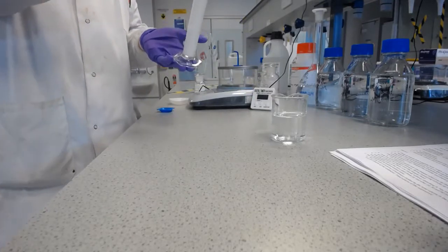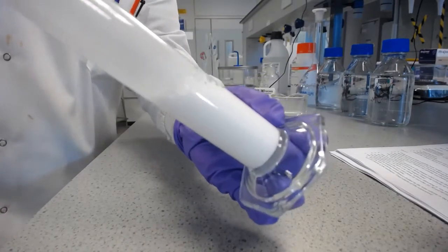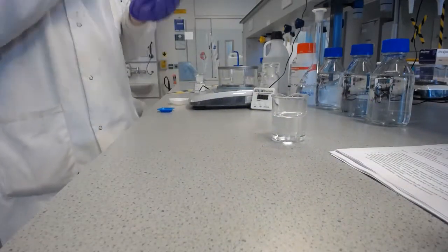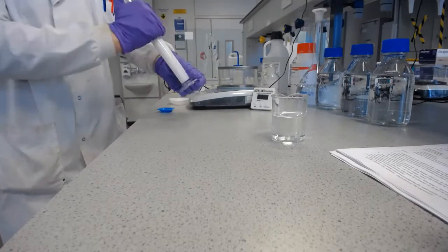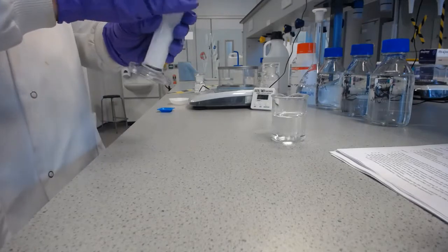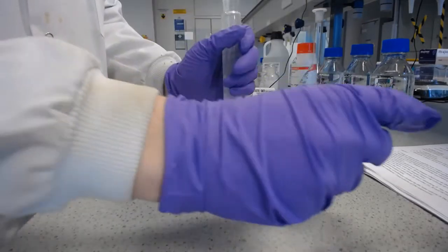And once I'm happy that that's nice and homogeneous and is mixed through without any lumps, I don't know if you can see at the top there, there's still a few little lumps. So I'm just going to give it a bit further of a shake. Once I'm happy that that's homogeneous with no lumps, we will then accurately top it up to the 50 millilitre mark.